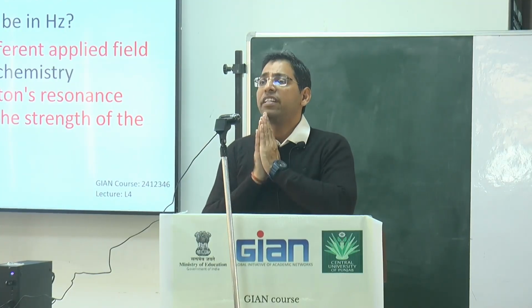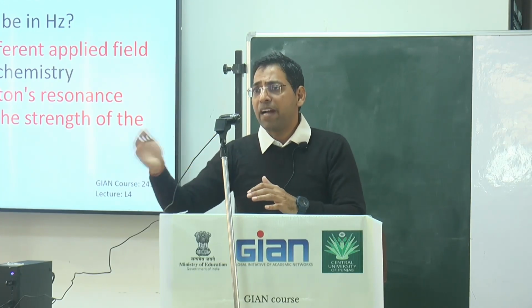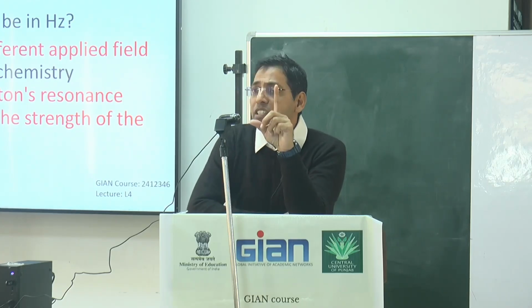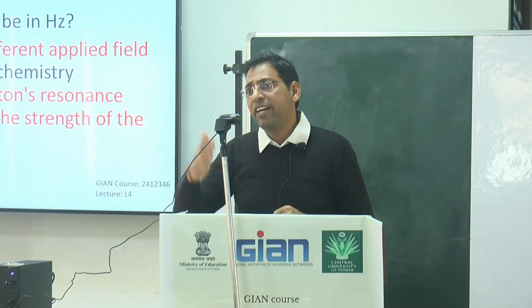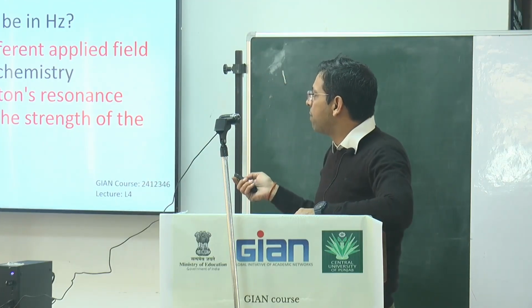There is no interconversion concept which can convert his pattern to mine. Every different machine gives a different spectrum for the same experiment, the same data, and you can't convert one data into another. So hertz is not a good concept, basically.